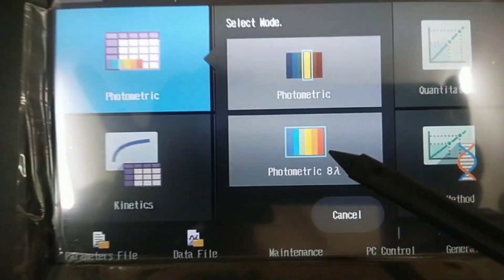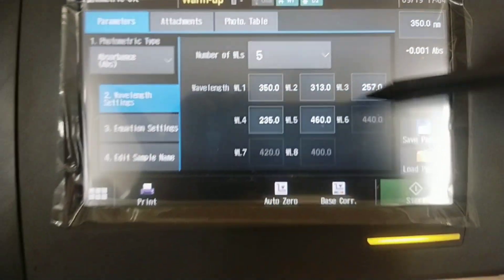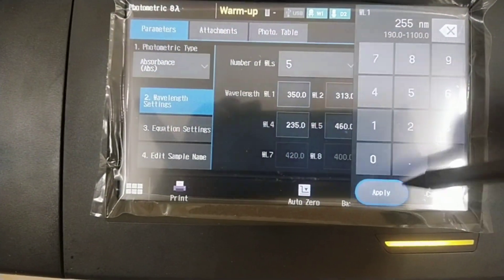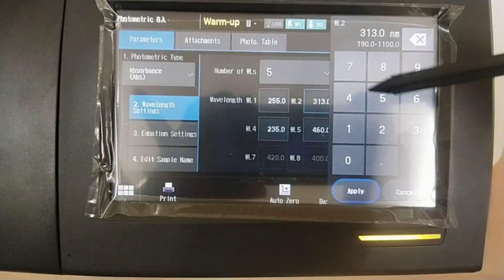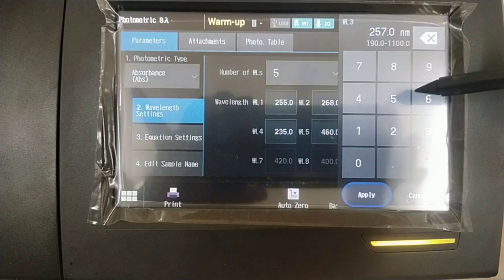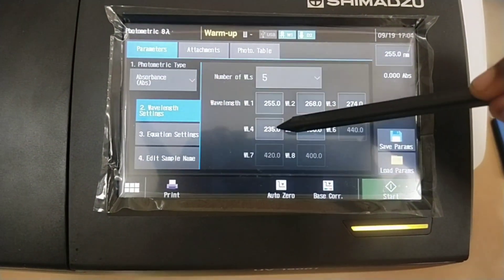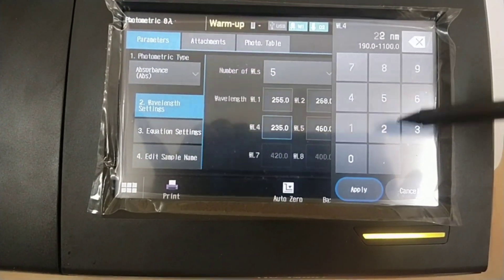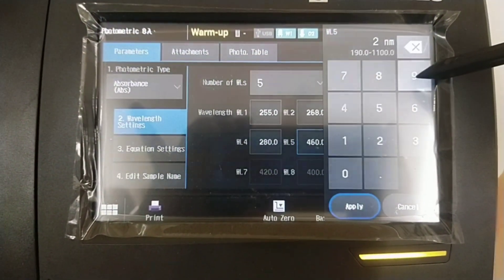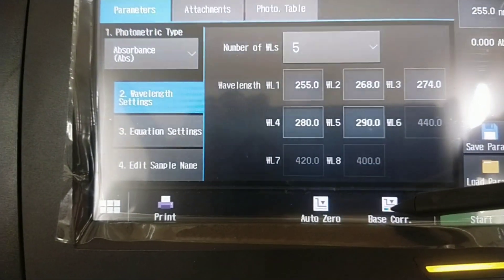Multiple wavelength mode allows measurements at up to 8 designated wavelengths. Here you can observe the selection of wavelengths. After selecting wavelengths, go for baseline correction and start measuring the sample. In single wavelength and multiple wavelength modes, photometric modes are percentage transmittance or absorbance. Observe how wavelengths are selected and baseline correction is performed for the selected wavelengths.